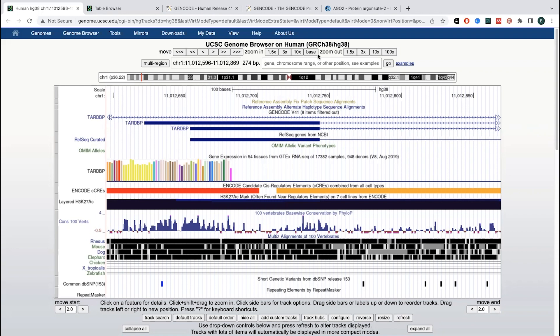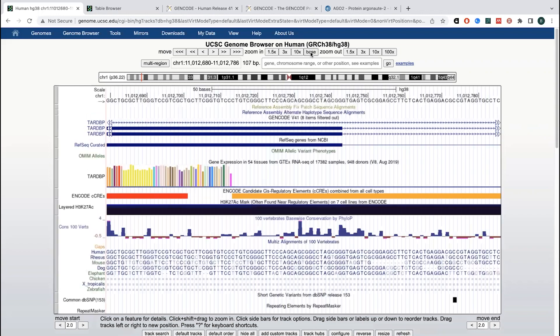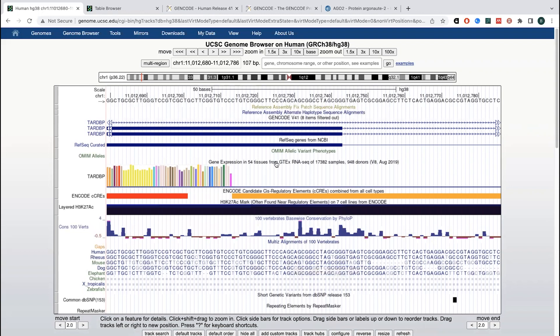what you'd see was that if you go to this base level, you'd see individual nucleotides, individual DNA letters. You also see, though, a bunch of other stuff, all this other stuff over here, this is all annotations, and it's helping tell you what's what.